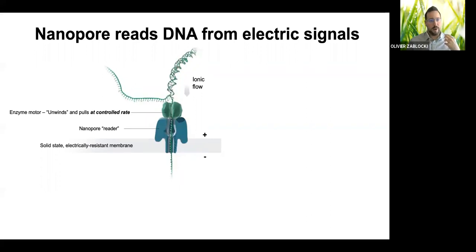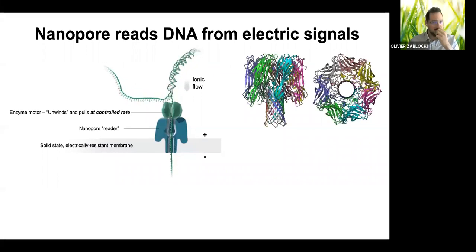And so one of the neat features is that this is actually from a bacterium. This nanopore is a re-engineered nature's design from a toxin, specifically an alpha hemolysin from Staphylococcus aureus. And the logo of the company is actually a top view of this nanopore enzyme, just as a tiny fun fact. I like to understand what I'm seeing, so I had to research what that logo meant in this context.